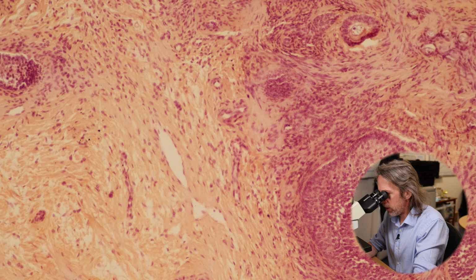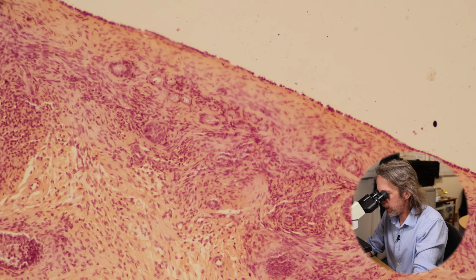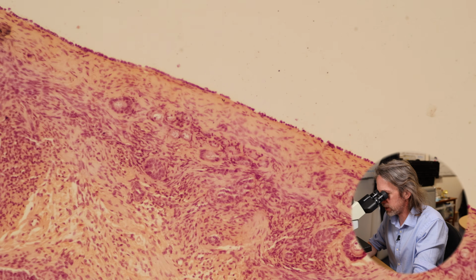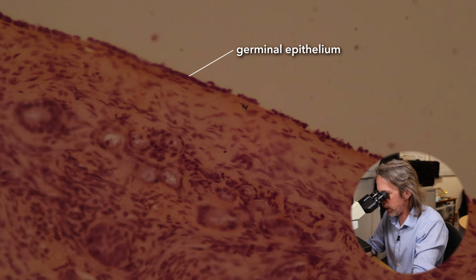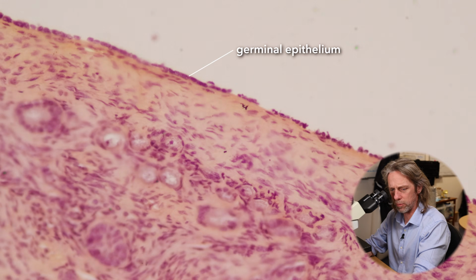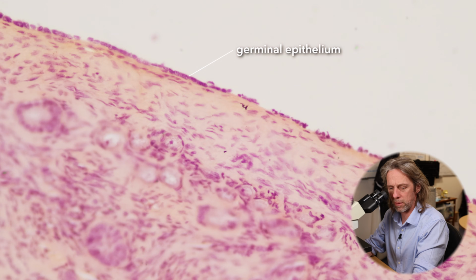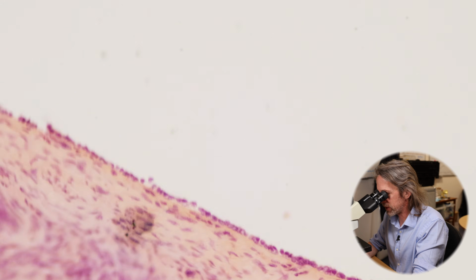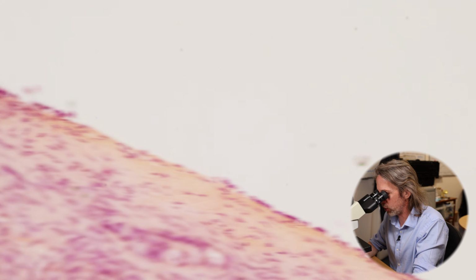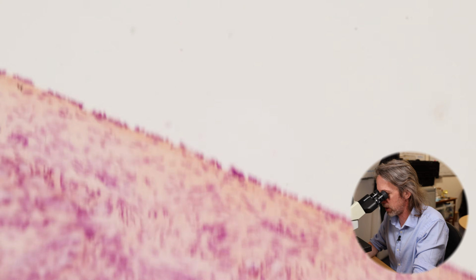Fun fact, maybe: do you see how on the surface of the ovary there, look at that, there's a single layer of cells. Isn't that interesting? That gets called the germinal epithelium. It's not really a germinal epithelium at all. I guess it's where scientists originally thought that oocytes came from. These aren't germ cells, but this is a single layer of cells covering the surface of the ovary that gets called the germinal epithelium. So watch out for that. That's a point of confusion.